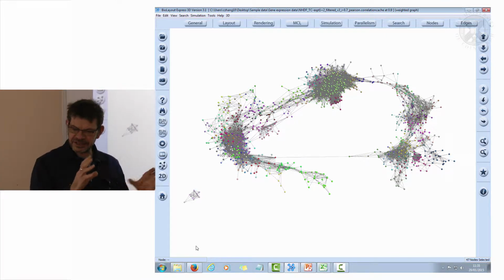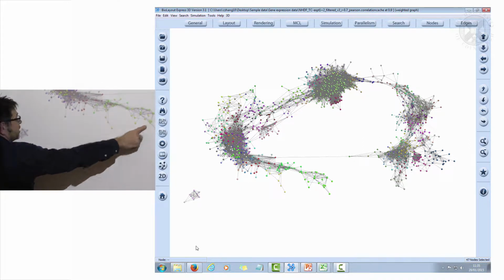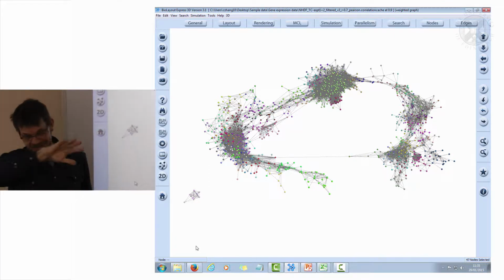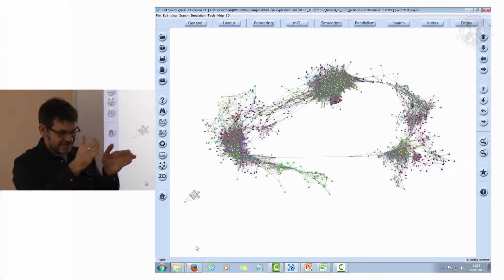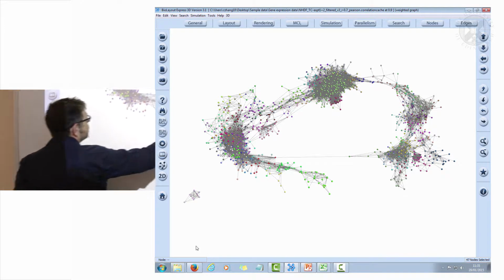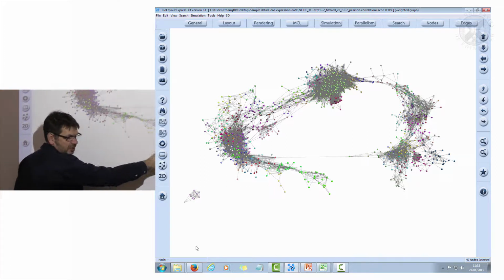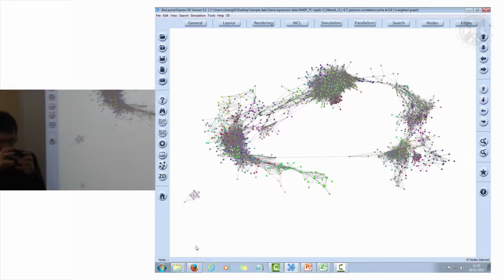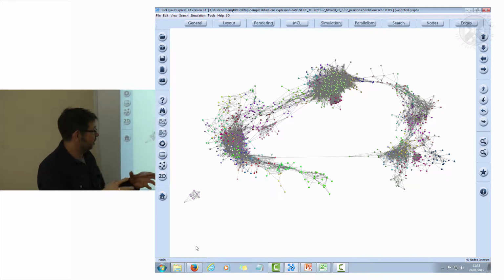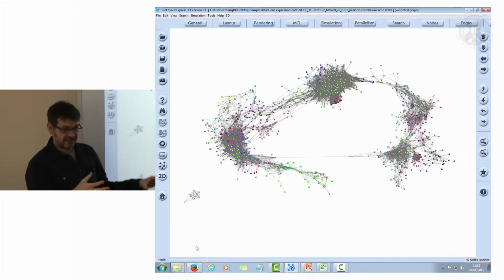So this is a relatively simple experiment. There's 2 things to notice about this, that in time course experiments what we're actually dealing with is a continuum. So things go up and some goes up and some goes up, it's a series of stepped events, and what you'll often see in that kind of structure is an elongated graph structure, okay? So a bunch of genes which are all related to each other and have no relationship to anything else will form a tight cluster. So although you're not familiar with how these graphs look, when you start getting your eye in, you can almost understand the structure based on the way it's displayed.